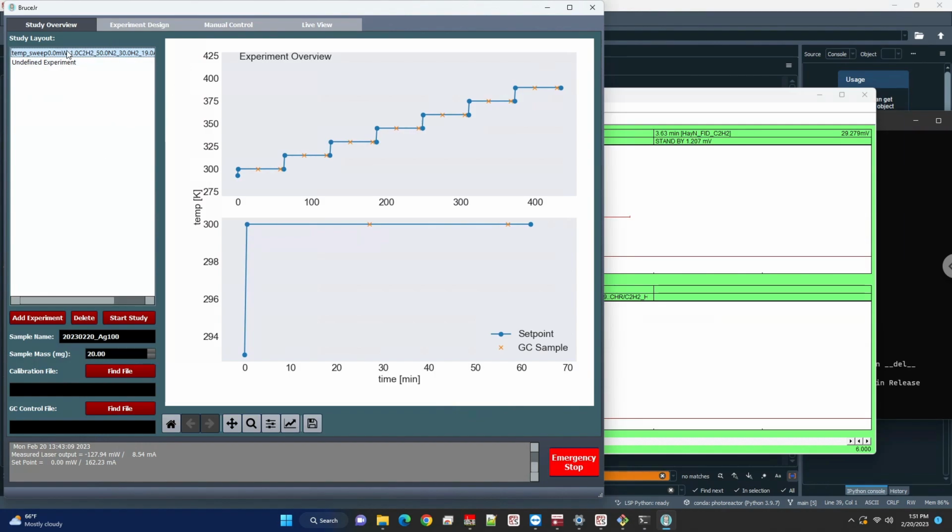Be careful with where you save this data ultimately, because we use some pretty long folder names and file names in how we save the data. If it gets to be too many characters, if it's really deep in some data structure, then it might not save correctly anymore. So be careful with where you put this. Usually higher level folders are a little bit better, but you can go to pretty deep folders and still be okay.